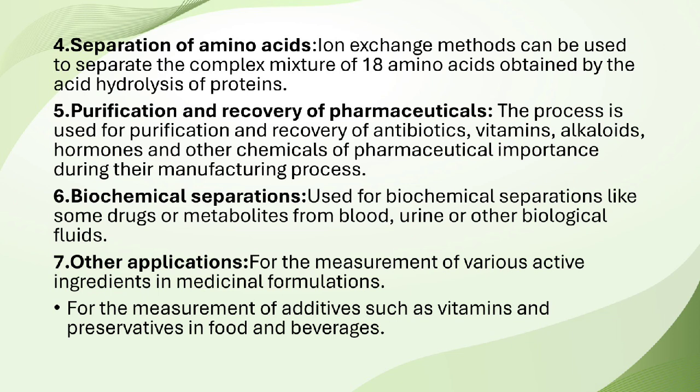Lastly, other applications for the measurement of various active ingredients in the medical formulation, such as measurement of the additives such as vitamins, preservatives in the food and beverages.